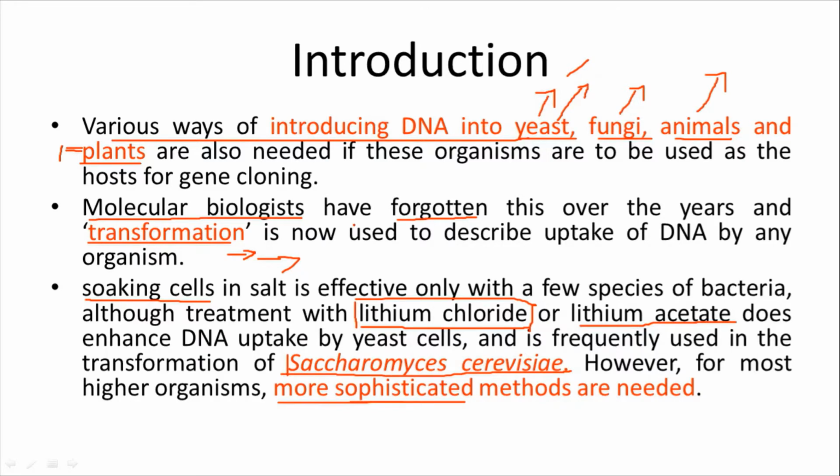So if you are using lithium chloride, you can easily estimate how much of the external DNA is going to be involved in the transformation. Simply called transformation efficiency, we can easily measure it using sucrose gradient centrifugation and density gradient centrifugation. That's why people are doing the old method today also. Anyhow, sophisticated methods are needed for efficient gene transfer to the host.